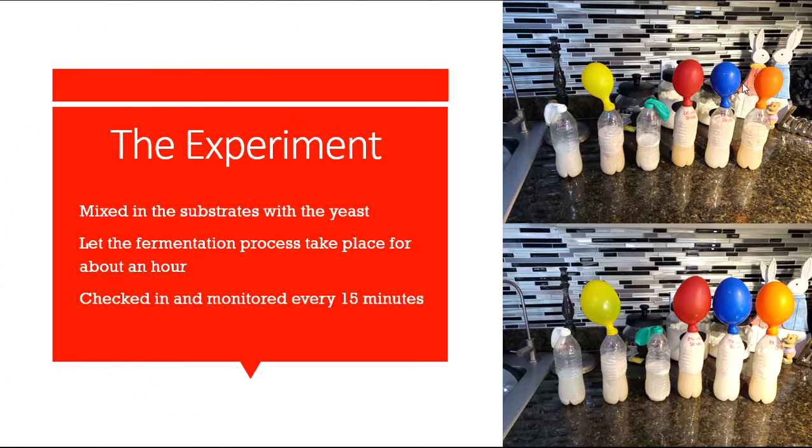From there, I let the bottles rest for 1 hour as I let the yeast fermentation take place, making sure to check in about every 15 minutes. The top photos are taken 15 minutes into the fermentation process, while the bottom was taken 30 minutes into the fermentation process.